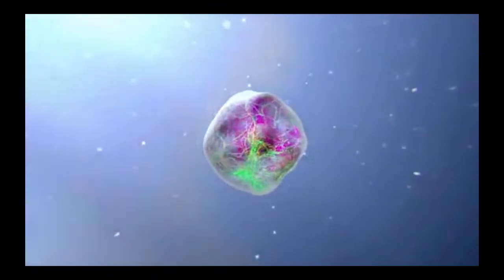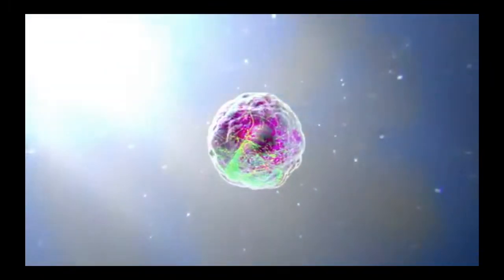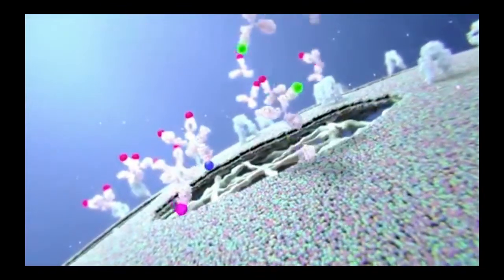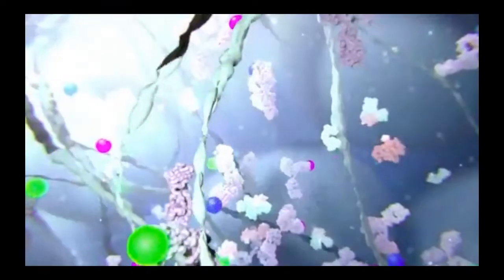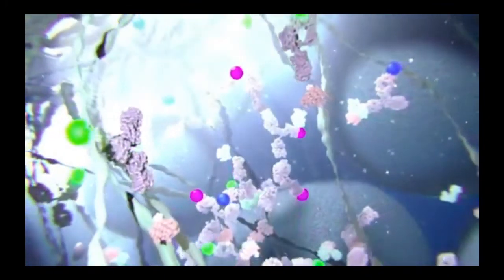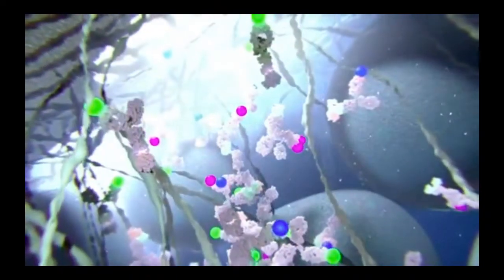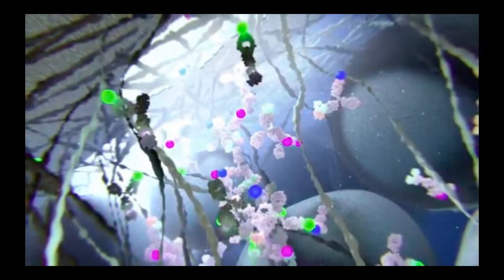The first step of intracellular flow cytometry is fixation of the cells using formaldehyde, which immobilizes proteins and preserves transient signaling events. Cells are then permeabilized with methanol or detergent, allowing antibodies to access the intracellular space. Optimal fixation and permeabilization conditions depend on the location and biochemistry of the target epitopes and should be carefully considered to ensure successful antigen detection, especially when staining surface and intracellular proteins simultaneously.